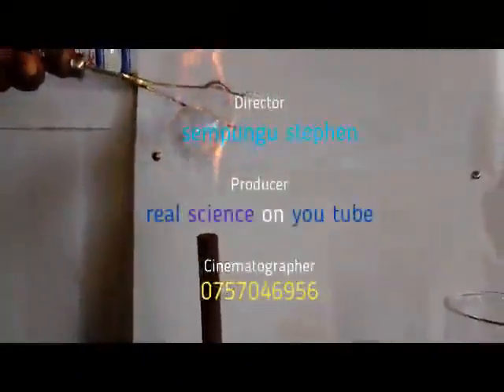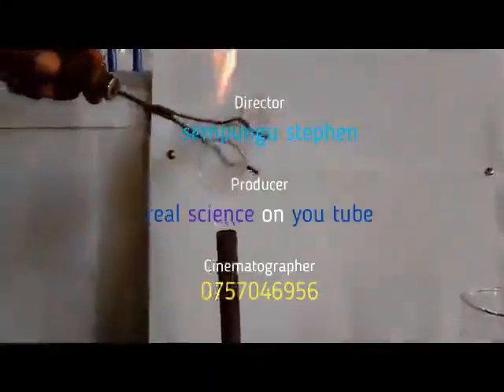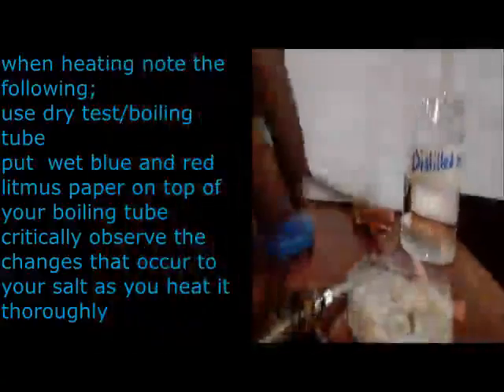After drying properly, then we make sure that we go to the point where our sample is. Now for our sample, we are going to use the spatula end. So you can see we are drying now our test tube. Then after drying our boiling tube, we use the spatula. Then now we add our sample. So you add such that all the solid moves down.